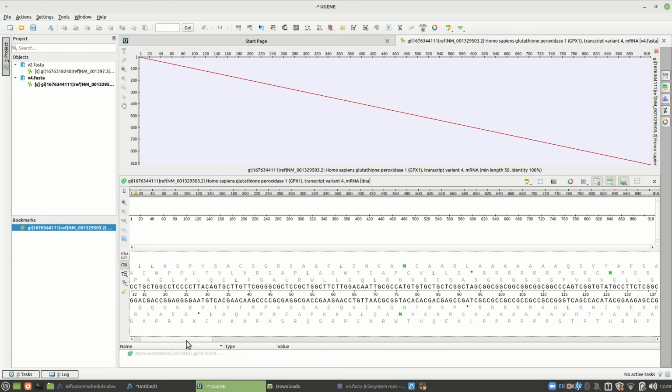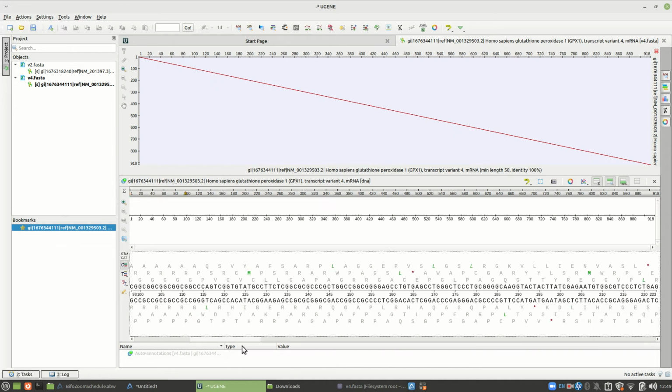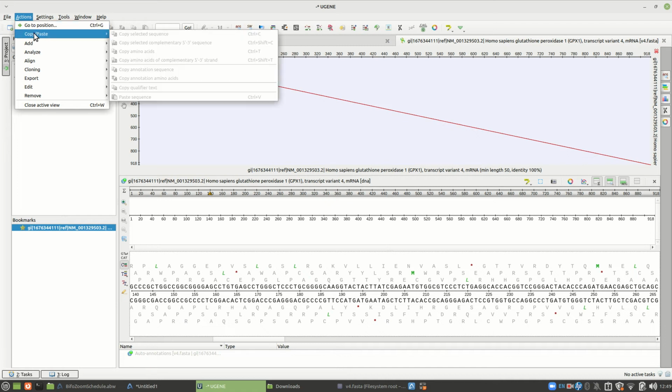Where is the splice site? When we looked at that other piece, how many base pairs were in it? We should have looked to see where that splice site was. Is it after 220? This little star right here, is it after that? So let's go back. Where was our splice site?